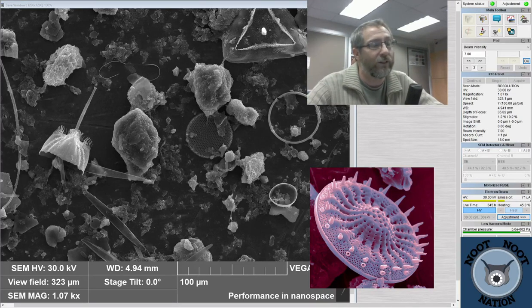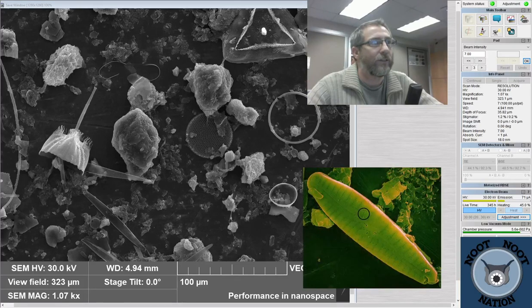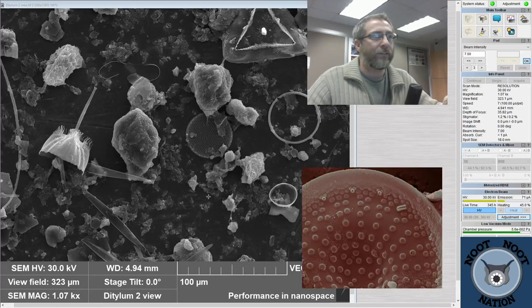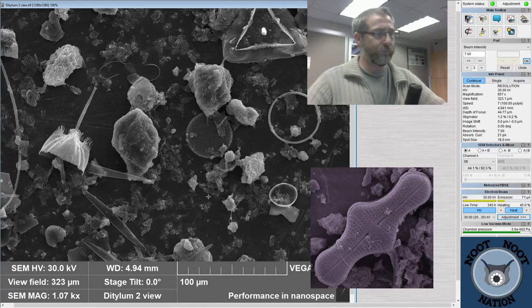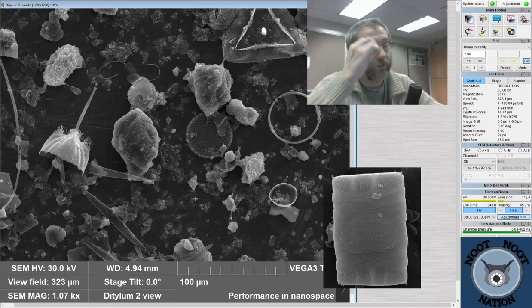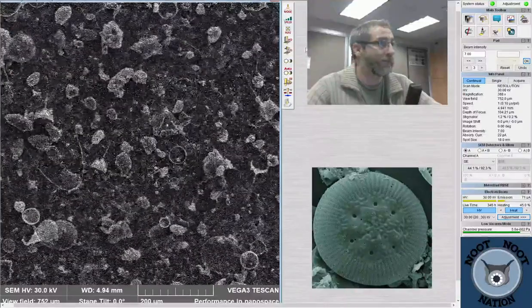I've used just the scanning electron microscope to render a 3D image. One of the things that you can't see is that I can rotate the stage and I can tilt the stage, up to 60 degrees or something like that. I will turn it a little bit at a time and then tilt it, and then turn it a little bit at a time, going all the way around objects. We use a process called photogrammetry, which will turn that series of pictures into a three-dimensional object, and I can make them into 3D models. I do that occasionally for some diatoms. It's a lot of work, very tedious, but it's easier to do on my scanning electron microscope than most.